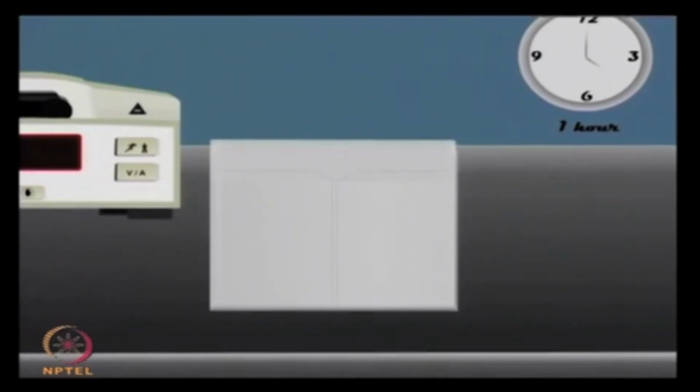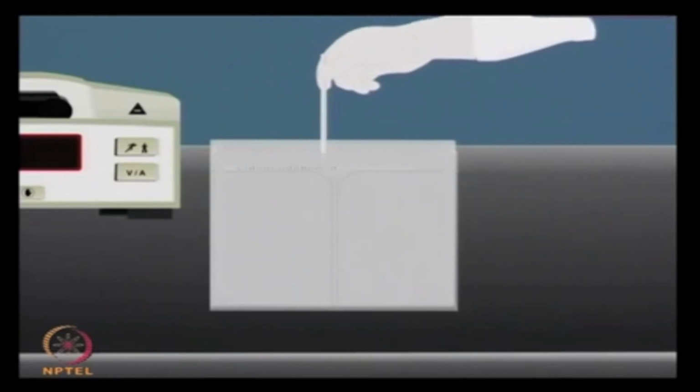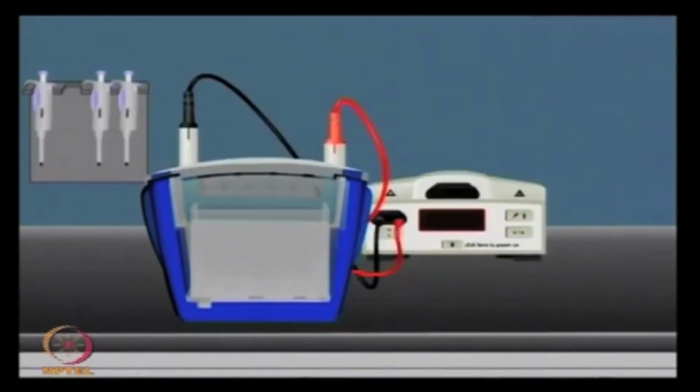So, prepare the gel casting solution consisting of acrylamide, bisacrylamide, Tris chloride, SDS, APS and TEMED. Once the gel is polymerized, then you can add the IPG strip, and now ensure that the assembly is properly sealed and buffers are properly placed, so that proteins can be separated based on their molecular weight.